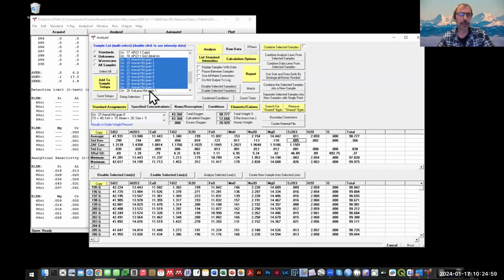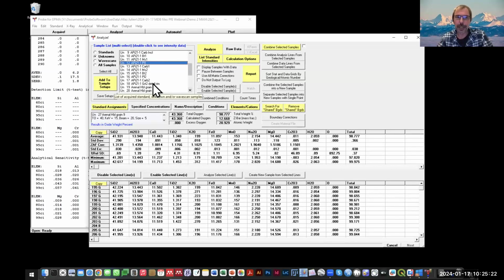But it can normally very nicely show you the presence of any elements and precisely and accurately measure them down to 100, 200 ppm, shall we say. So with that, I have my very versatile setup. I can potentially, if I were to analyze, for instance, titanium in quartz, we have the problem here that titanium in that case would be a trace element. Yet you can still potentially use that.